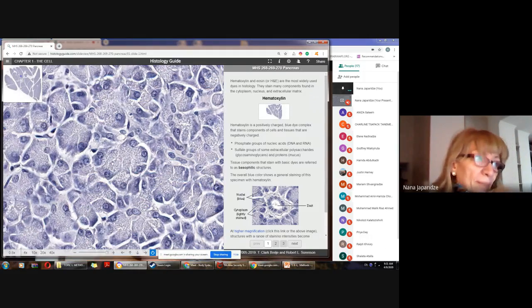So back to the cell, we see quite well the nucleus. Nucleolus is also visible there. You can identify dark stained part of the nucleus. Look, these blocks of dark stained something, and this something is chromatin, of course, heterochromatin, and the much lighter stained part is euchromatin.